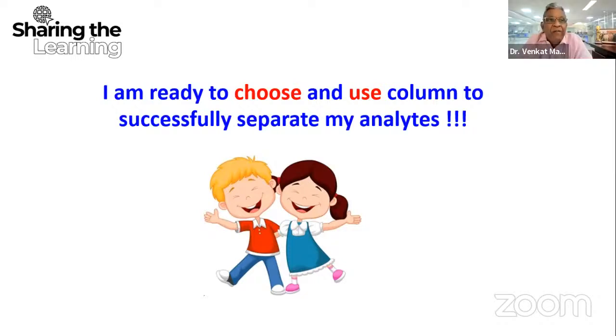Yeah, we will be giving a talk on troubleshooting, and there we will cover a particular portion called column care. In that we will incorporate all the details. It will happen maybe after 3 or 4 seminars. In that we will cover that one.